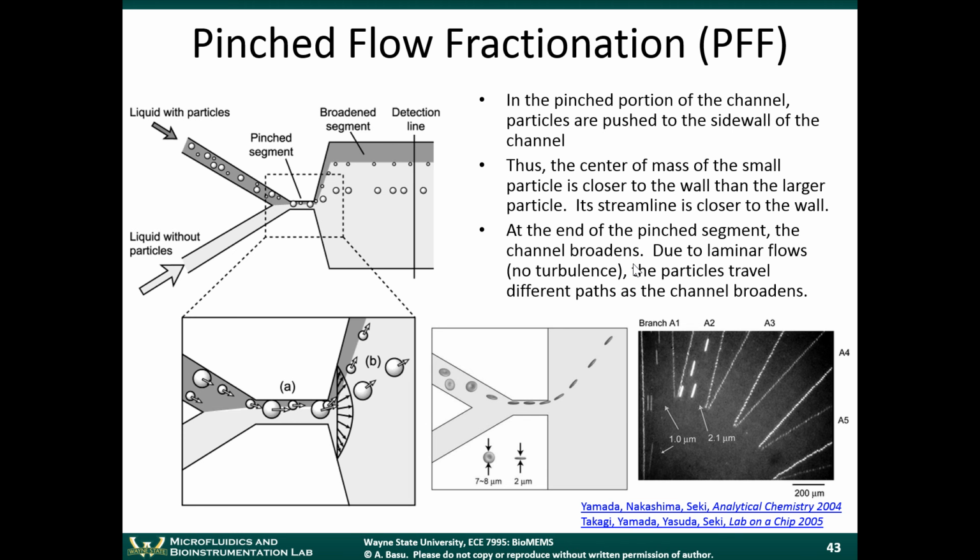So they even orient. So they actually flip. Yeah, in this case, this is interesting. This wasn't the main topic of the paper, but it was kind of interesting that they showed that disks will actually orient themselves according to the flow.